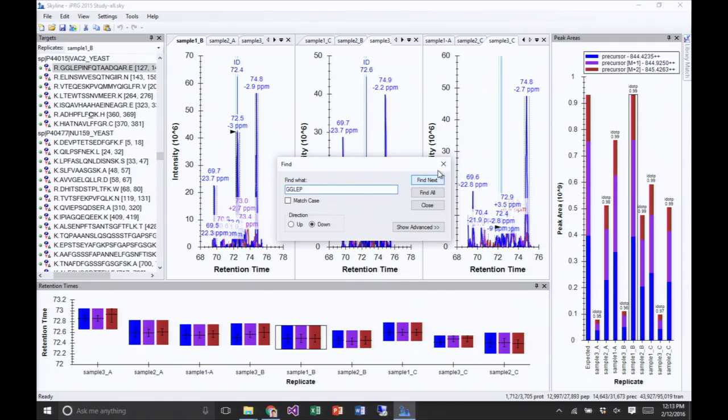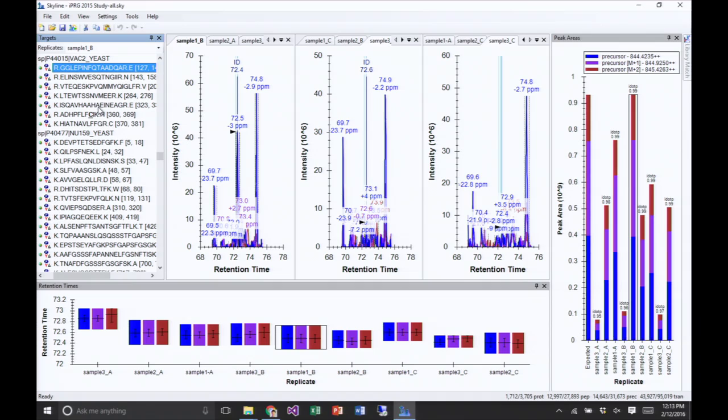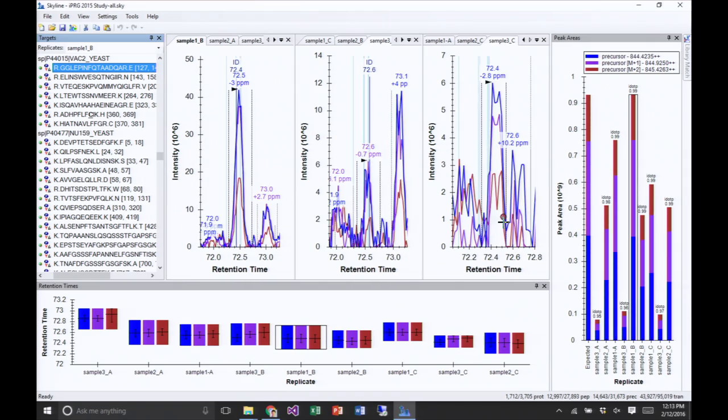And that will get you there too. And then you can see right away that in this, what I'm looking at, sample 3C doesn't have an ID, but it's got aligned IDs to tell it where to find the peak. We can press F11 and zoom in, and so here presumably is something fairly peak-like that we're using the aligned IDs to tell.